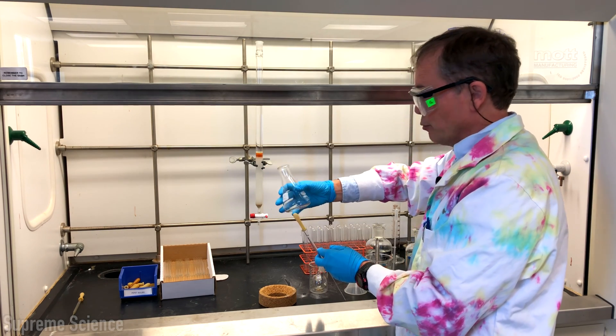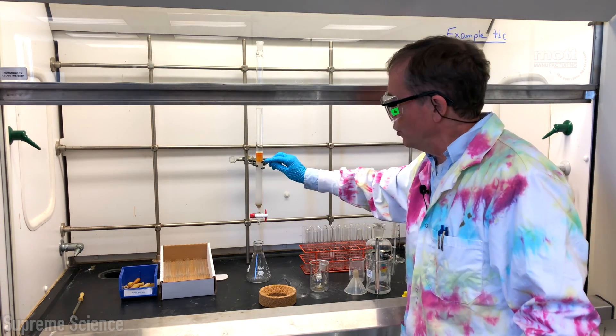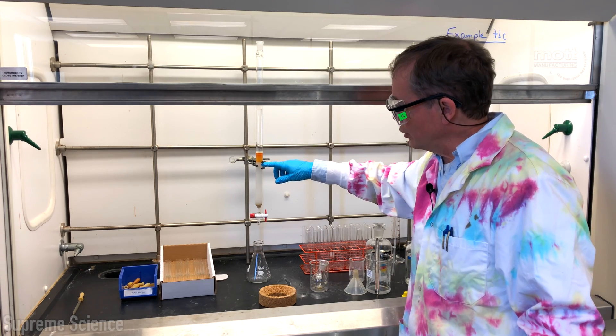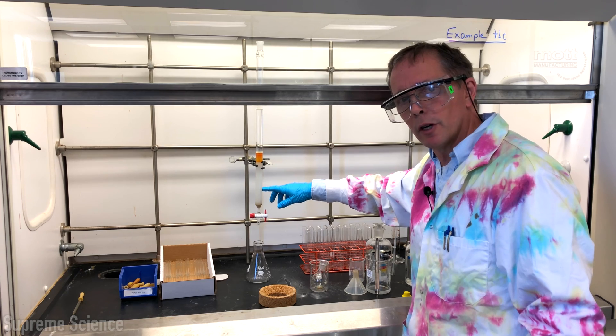If at any time you run out of your 2 to 1 eluent, you just make up some more. With this particular sample, we won't start collecting our fractions until the colored material is at least 3 quarters of the way down the column. So we've got a few minutes to go.